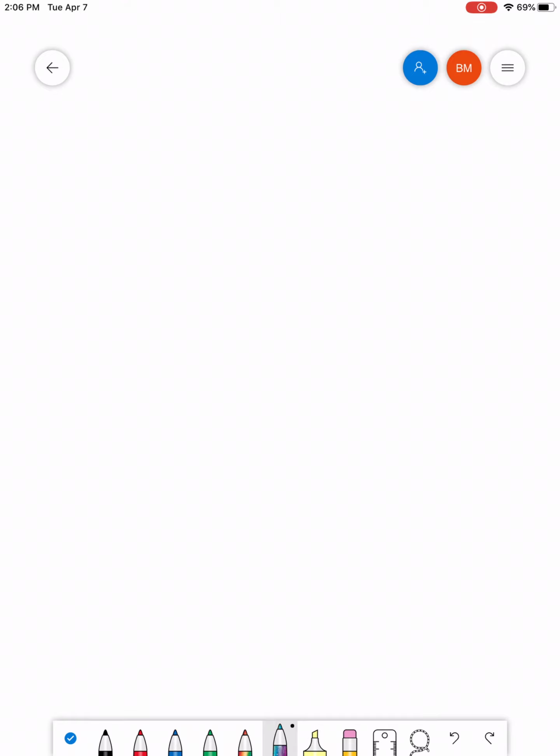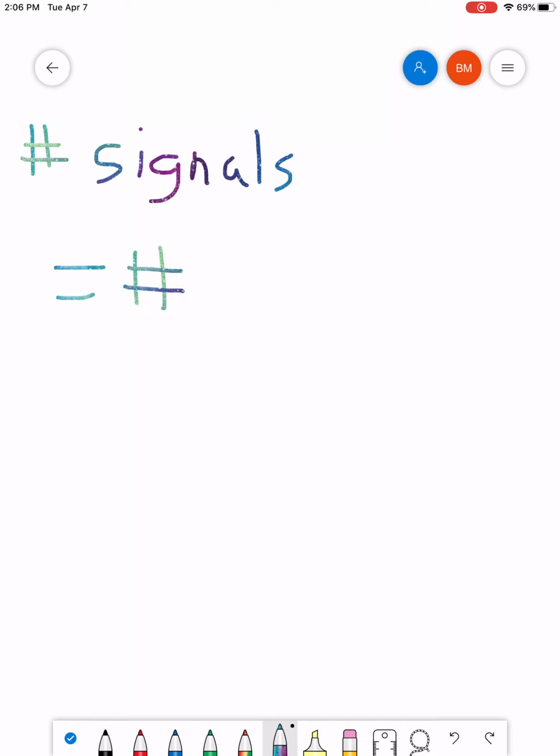Alright, so in this video what I want to talk about is the first aspect of what we looked at when we want to analyze an NMR spectrum, and that is the number of signals. Quite simply, by looking at the number of signals that you might have within a given spectrum, that can tell you how many unique types of hydrogen you have. Now, it doesn't tell you exactly how many individual hydrogens you have. It just tells you how many unique ones you have. Ones that are not the same, not chemically equivalent to other H's.